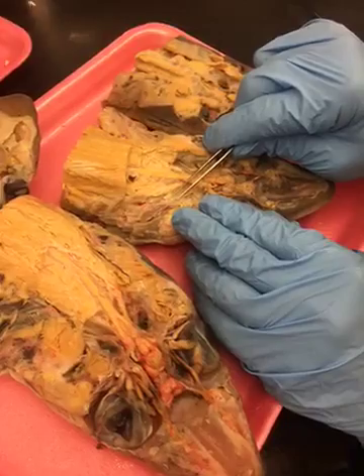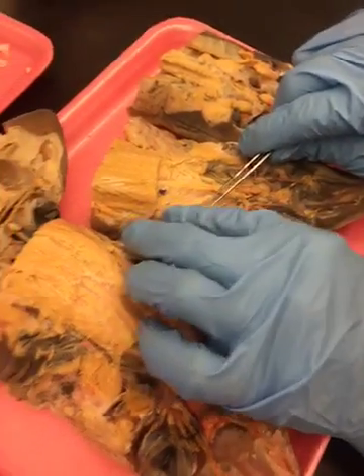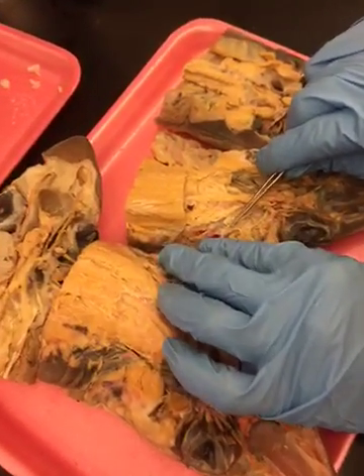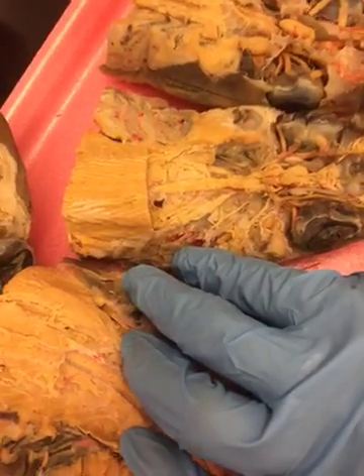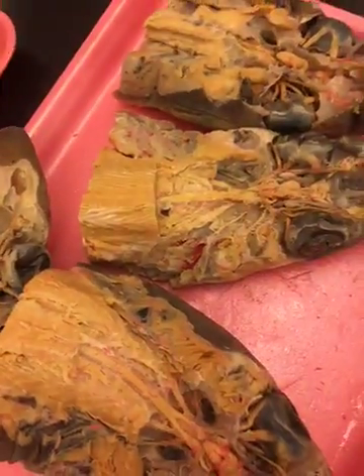That swelling is the petrosal ganglion. And if you get your face in there, you'll see a little pretrematic branch and a bigger posttrematic branch. And they're called pre and post because they're going on either side of the gill opening.